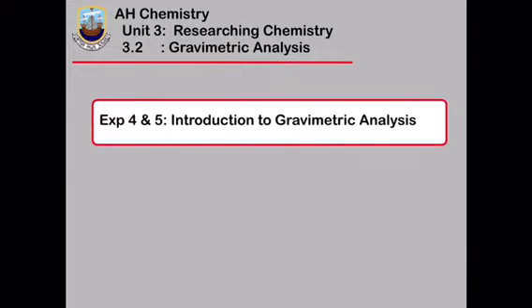In the second part of Unit 3, we are going to look at gravimetric analysis, which is analysis that depends on the measurement of the mass of reactants or products, as opposed to the measurement of the volume of samples, as we came across in the first part, the volumetric analysis.